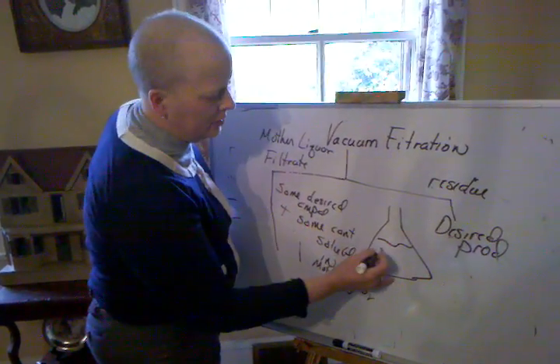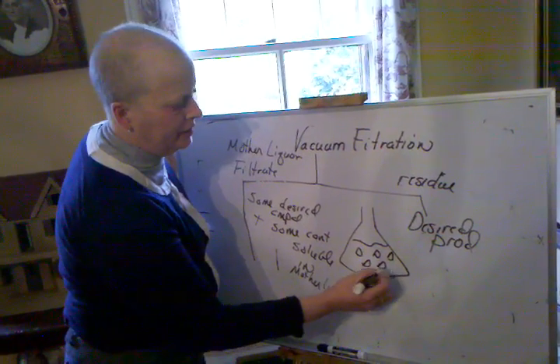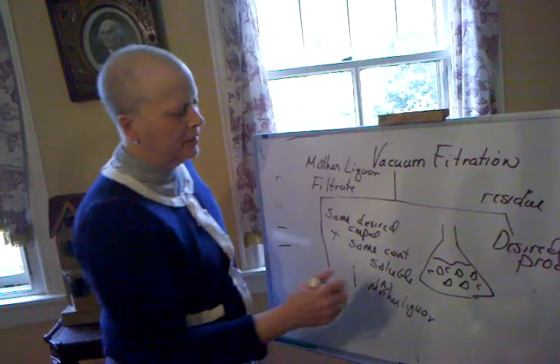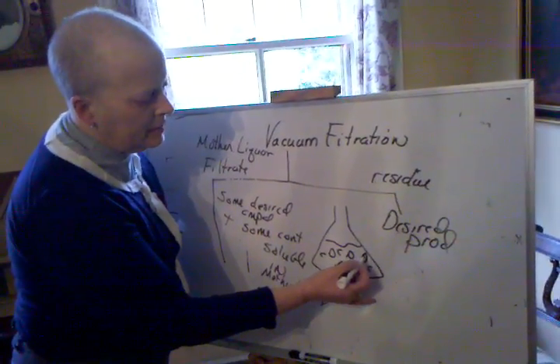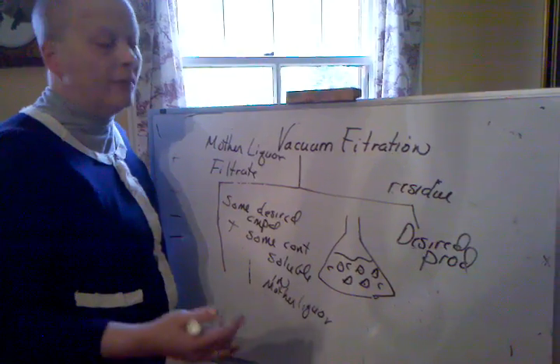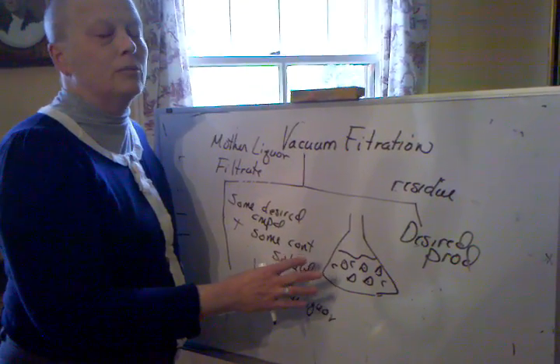And in this solution, let's say it's got your desired molecules dissolved in solution, and there's some kind of contaminant in here. And this is a different contaminant than the one we took out by gravity filtration. The idea here is that as this cools down, these desired molecules will no longer be solvated as well in the solution, because the solvent that was chosen isn't really the right match for that compound at room temperature.